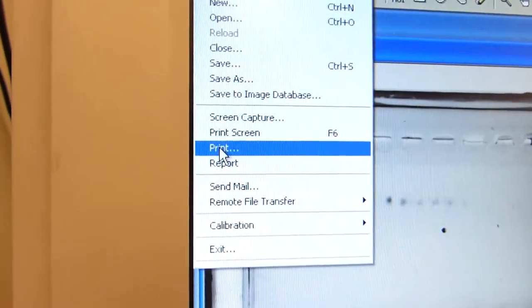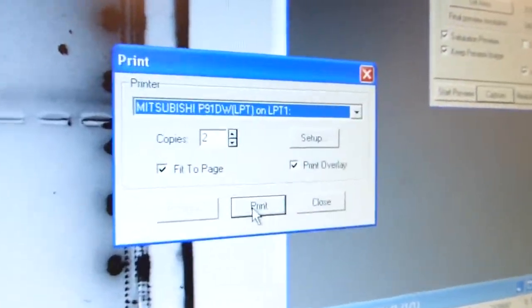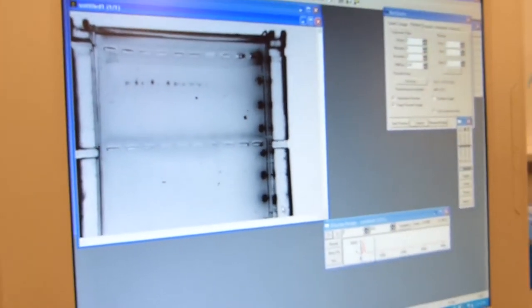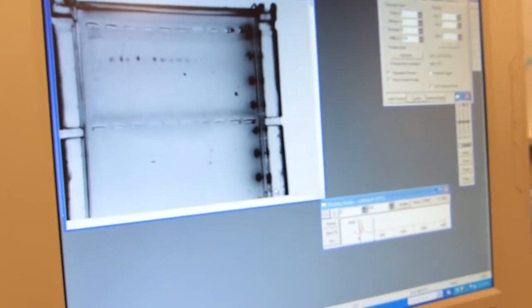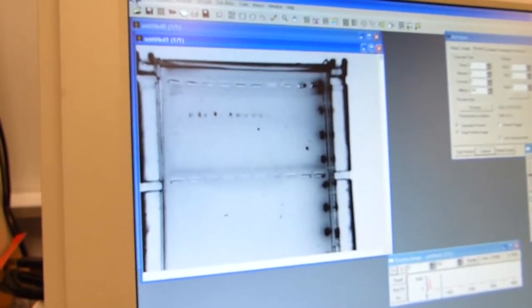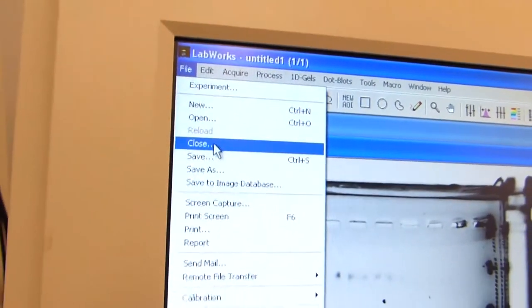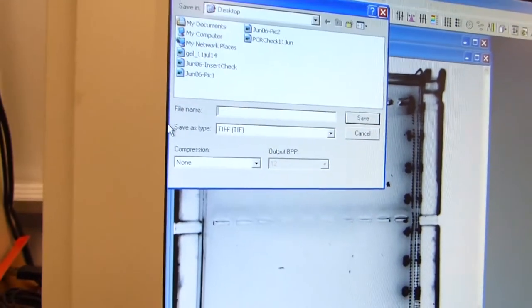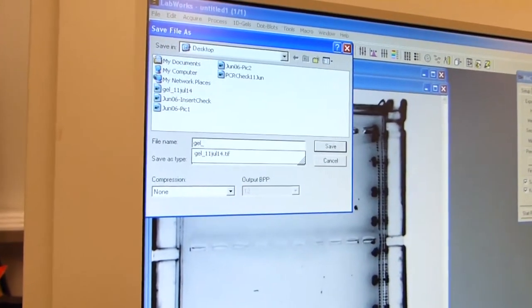From here we can file, print. And today we are printing two copies, one for each of us. While this is printing, you will also want to save the image. So you just go up to file, save and then name it something like gel and then the date.